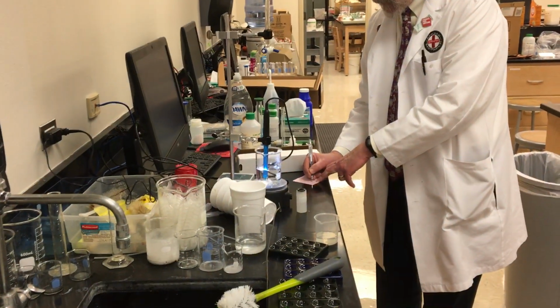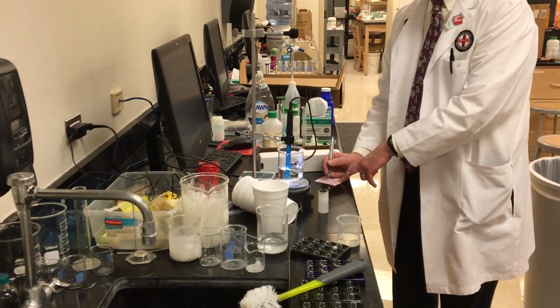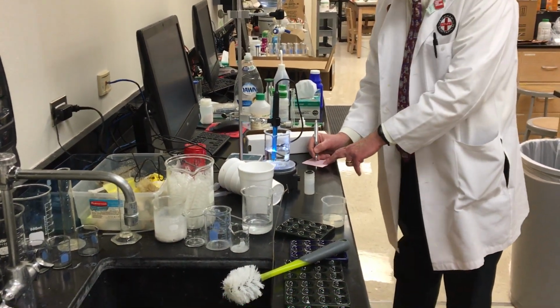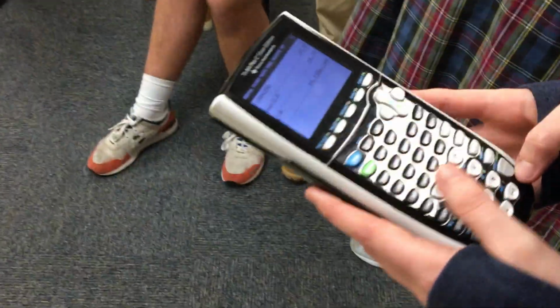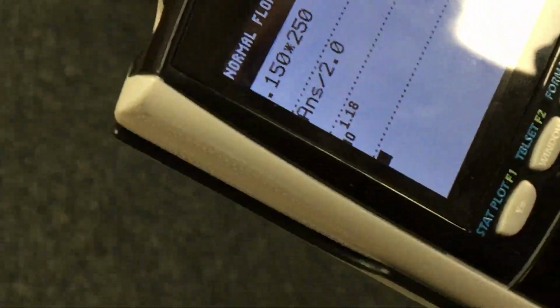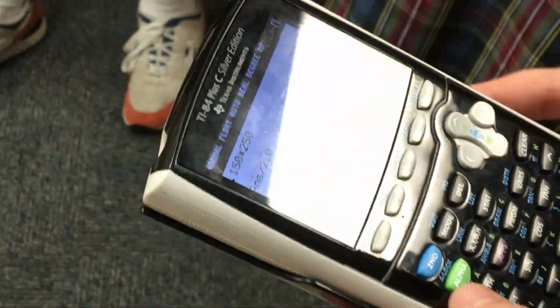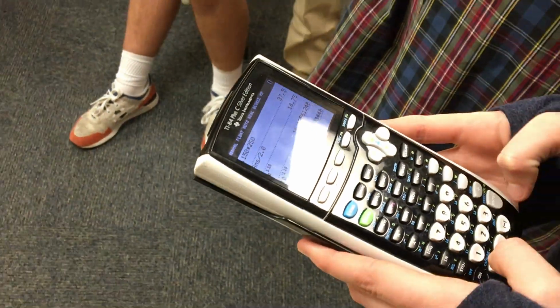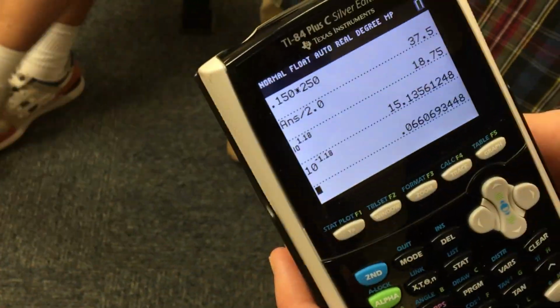What did you say the pH was? pH is 1.18. 0.066. Wait, what is the concentration? I got 15. Wait, what? That's not 10 to the negative 1.18 equals. Yeah, that should be right. 0.066. Yes. Okay, answer.